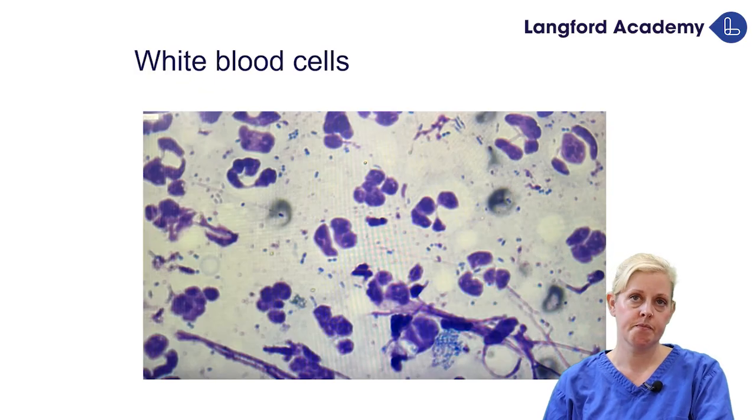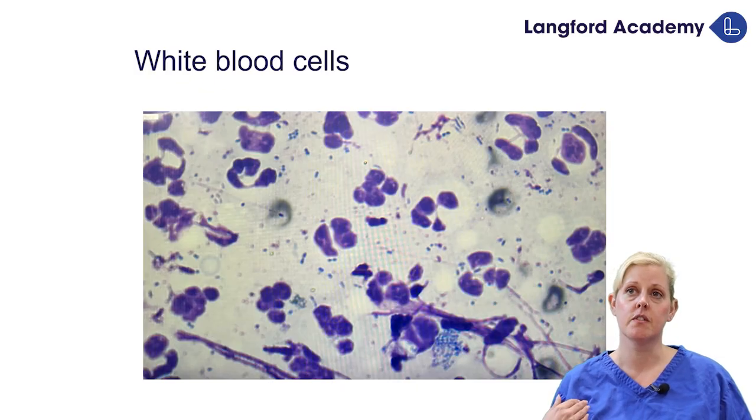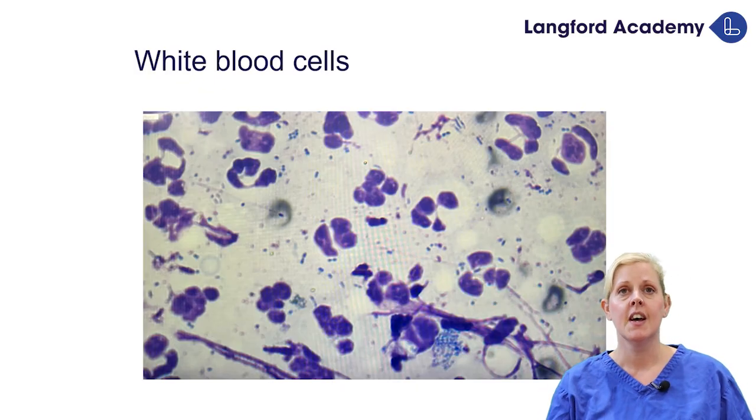These are white blood cells. These are neutrophils, but you can get anything down there, really. There's also some red blood cells here. I don't know if you can see them dotted around. They're the dark, almost shadows, just dotted around here. So this is the body's response to something not being right. Let's just spit something at it. And this is quite common to see in really active infections on the skin and within ears.